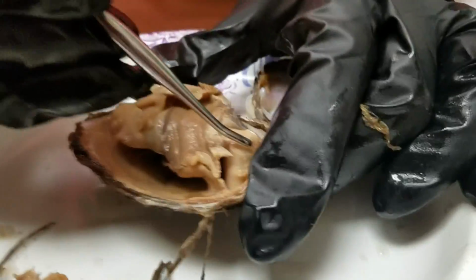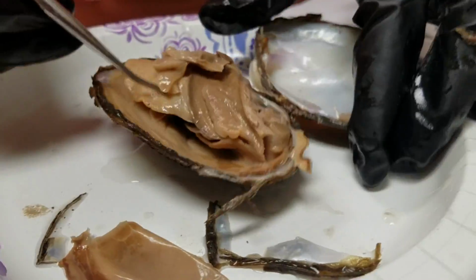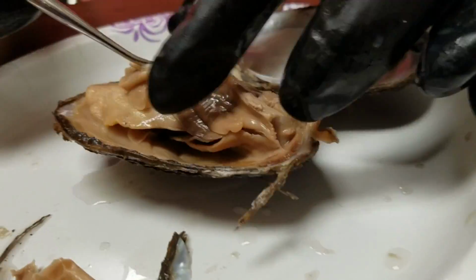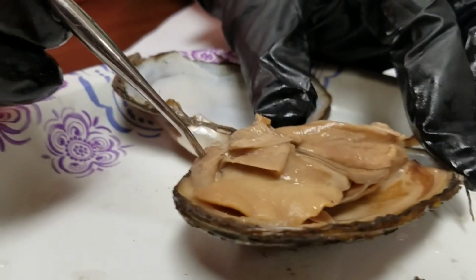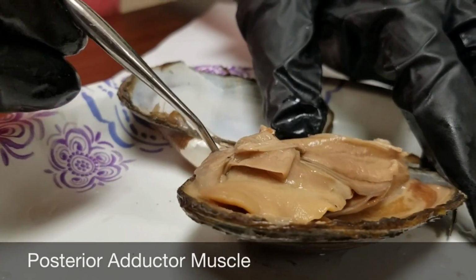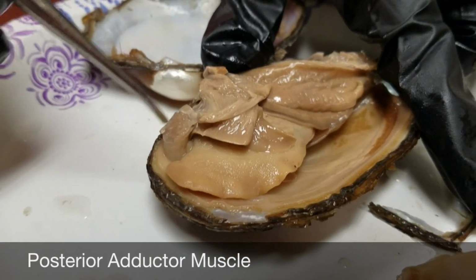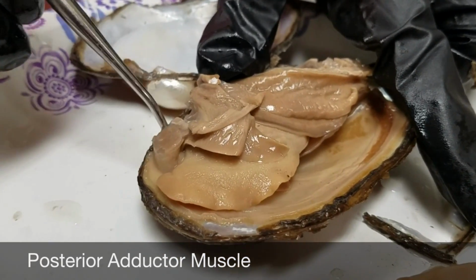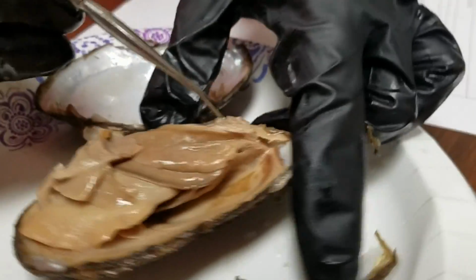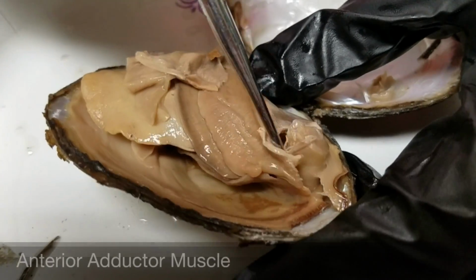Okay, so let me pull the mantle off of this one. We have the posterior adductor muscle. Okay, so the posterior adductor muscle is going to be over here. You can see it. It looks almost like a tree trunk or something, I guess. So that is your posterior adductor muscle. And then over here you have your smaller anterior adductor muscle.